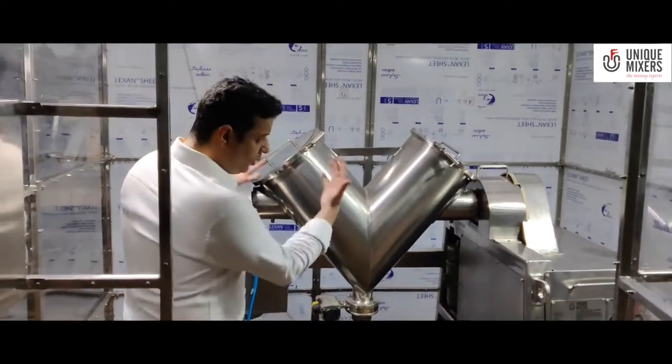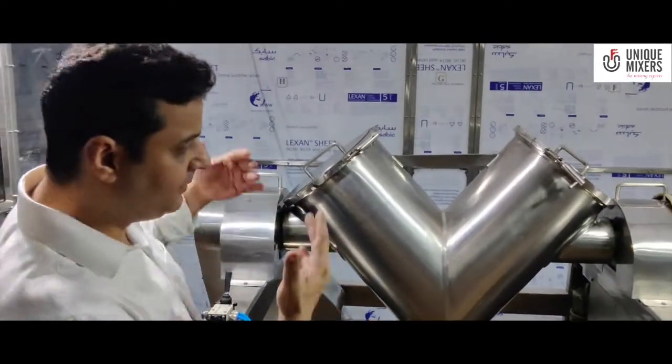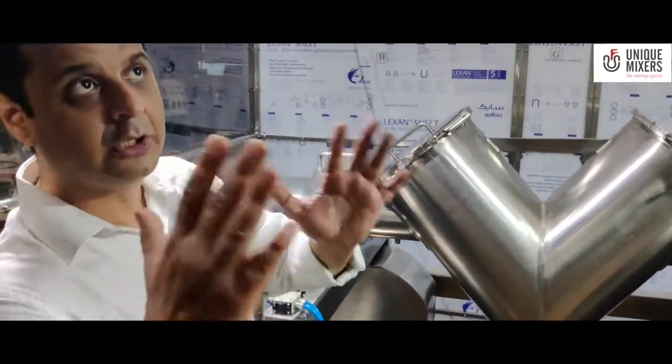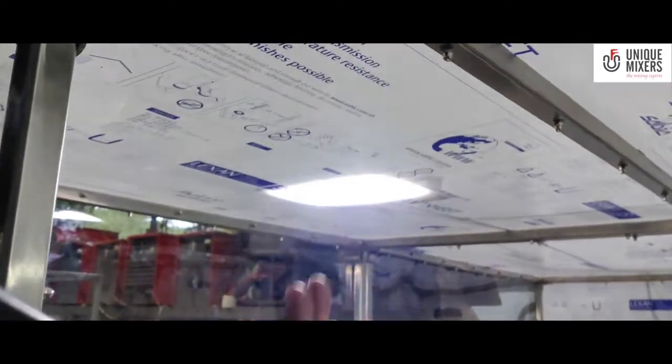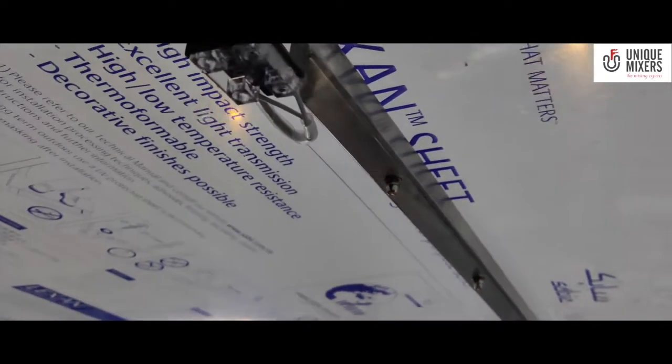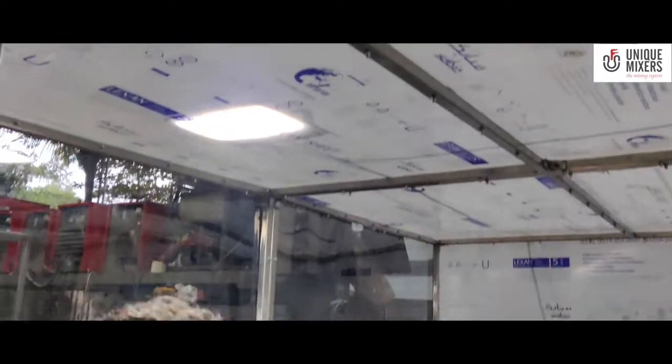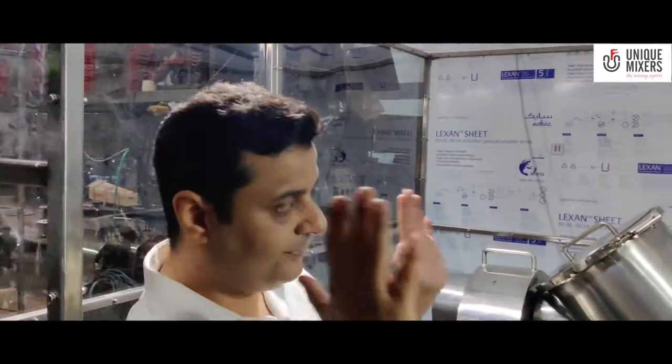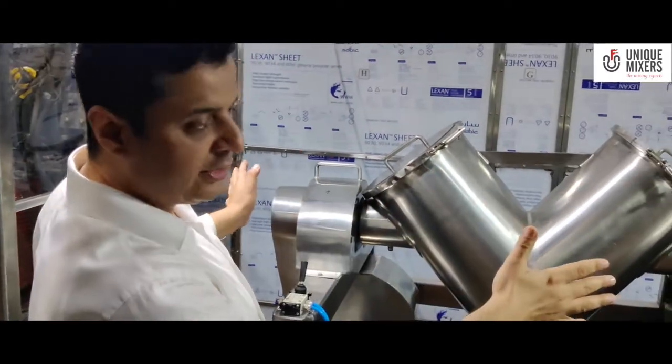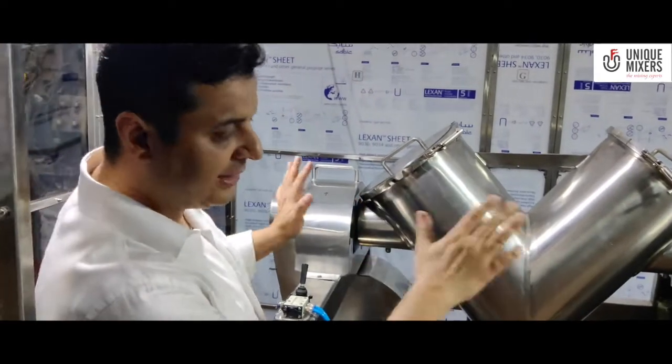I am standing here, while I am standing here the machine will not operate. For the machine to operate I need to go out, close the door. We have a safety switch right here. Once that safety switch is activated, that's when the machine will start. The moment I open the door the safety switch again will disconnect all electricals to the machine and the machine will stop.